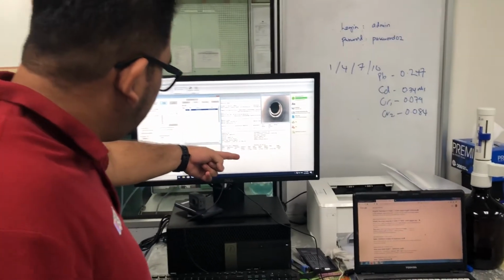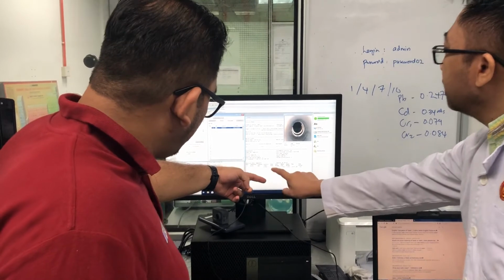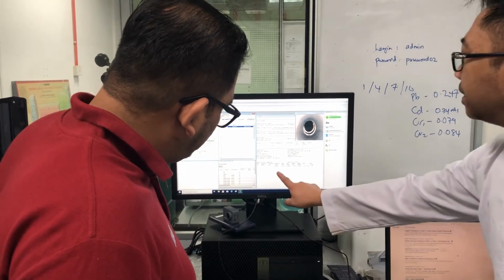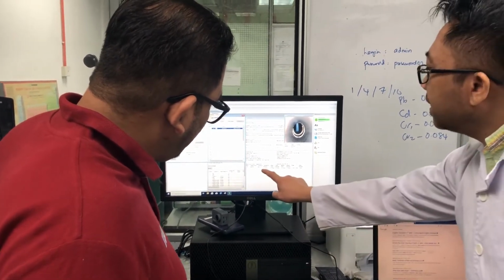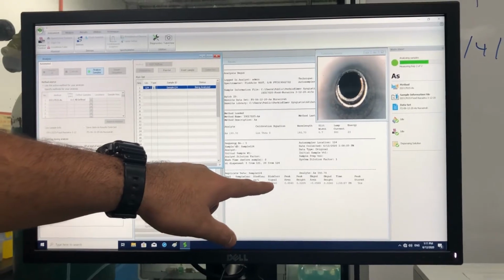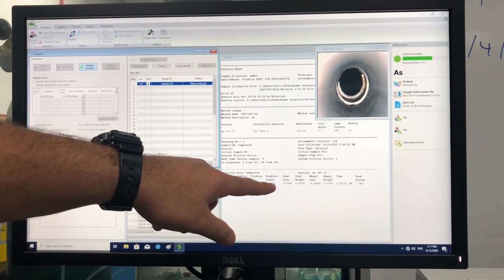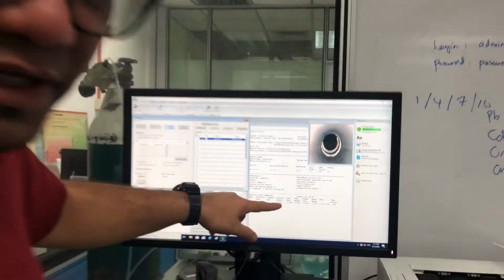So now we can see the absorption here, right, the big area. Right, so this is the absorption. Okay, so basically there is no absorption, very minimal, 0.004. 0.004 is basically only the interference inside the sample. Basically no arsenic inside the distilled water.